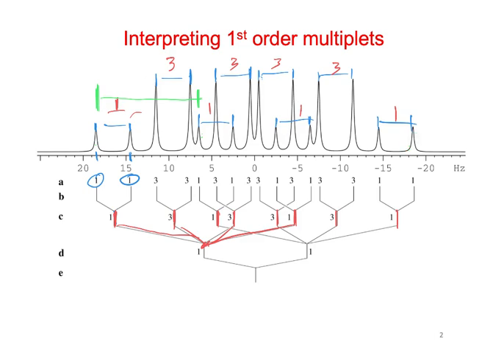So the other coupling, this one here, should match where I have that one drawn, or it could be drawn from here to here. Or you could do it on the other side from, say, here to here. So that would be the big doublet. So essentially we have one big doublet. It's split into quartets, and each of those are split into doublets.